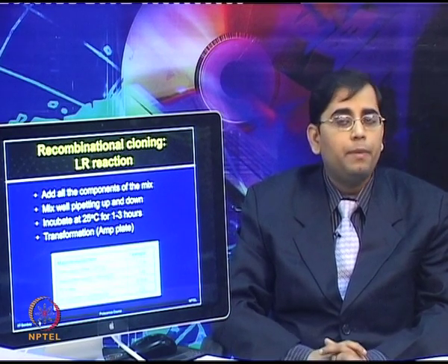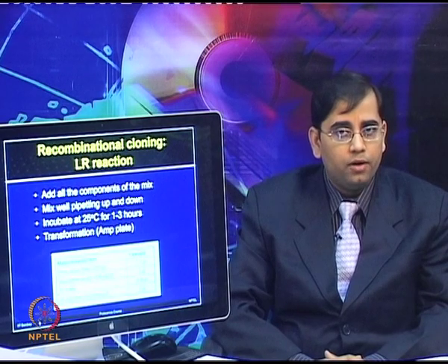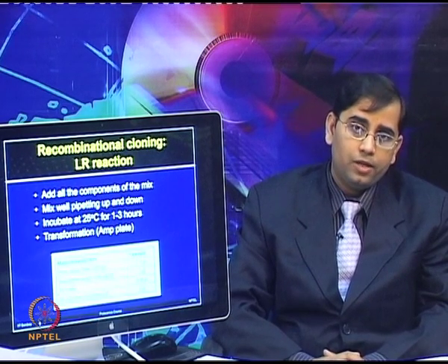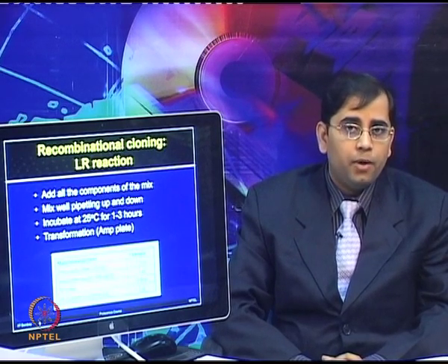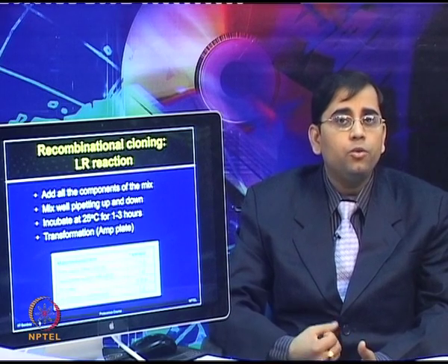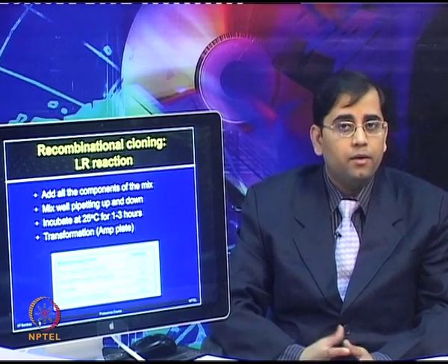So, add all the components of the LR mix, mix them well by pipetting, again properly up and down. Incubate the reaction at 25 degrees for an hour or 1 to 3 hours, and then this mix can be put on the plate for the transformation process on the ampicillin resistant plate. Now, this antibiotic will be able to screen only those clones which have the gene of interest in the right vector.